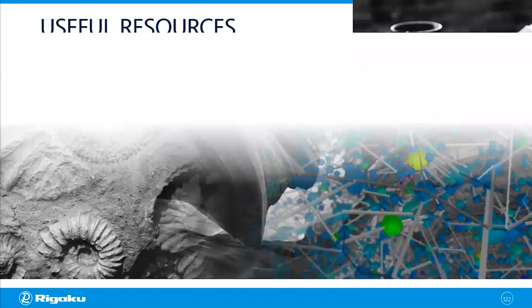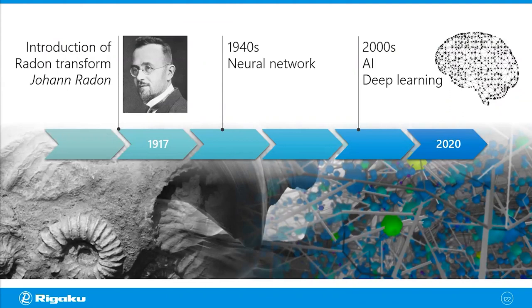Okay, so we just looked at all different kinds of analysis techniques today. And I want to mention that most of those techniques were really not feasible 10 years ago, maybe even 5 years ago. And it's been almost 100 years since Radon proved that X-ray CT can work in concept. And a lot of progress was made since then, including the invention of commercial CT scanners. But I think one of the most significant progress was made in the last 5 years.